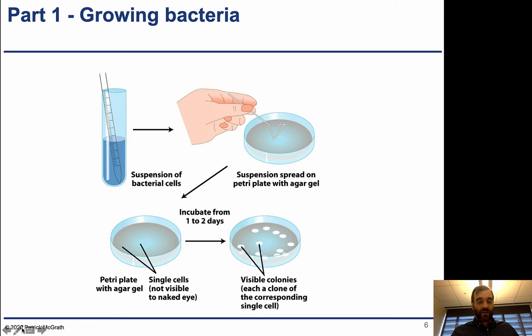And then you also might go back and forth from the agar plate back to the liquid, so you might have a test tube filled with media, and then you would simply pick one of these colonies. You'd have a little plastic tip, and you would lift up that colony, all the bacteria within that colony, and put it within the media in this test tube, and then again you would incubate and allow those bacteria to grow until they used up all the media within this liquid.